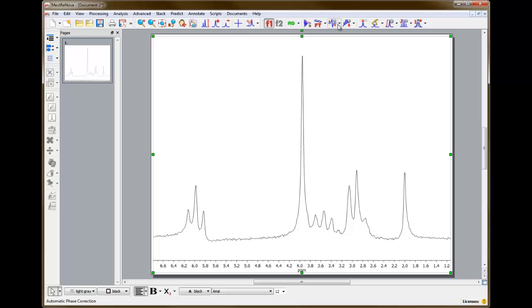Due in part to delays between the initial pulse and the onset of data acquisition, and to off-resonance effects, acquired spectra will have a mix of absorptive and dispersive signals. Your spectrum's peaks should display characteristic Lorentzian line shape, but some portion of the signal may be displaced below the baseline. You'll have to correct the spectrum by adjusting the phase of the spectrum.